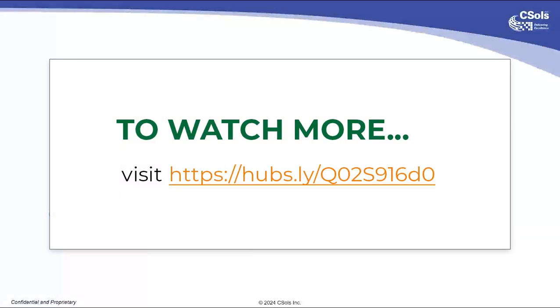So next, we're going to talk about committing and consigning data.